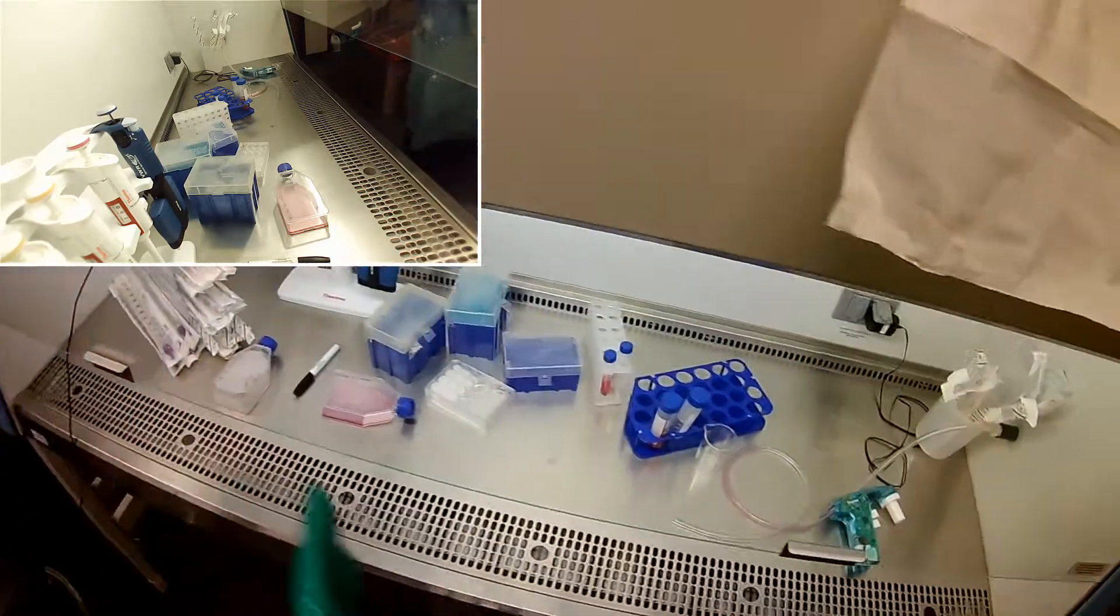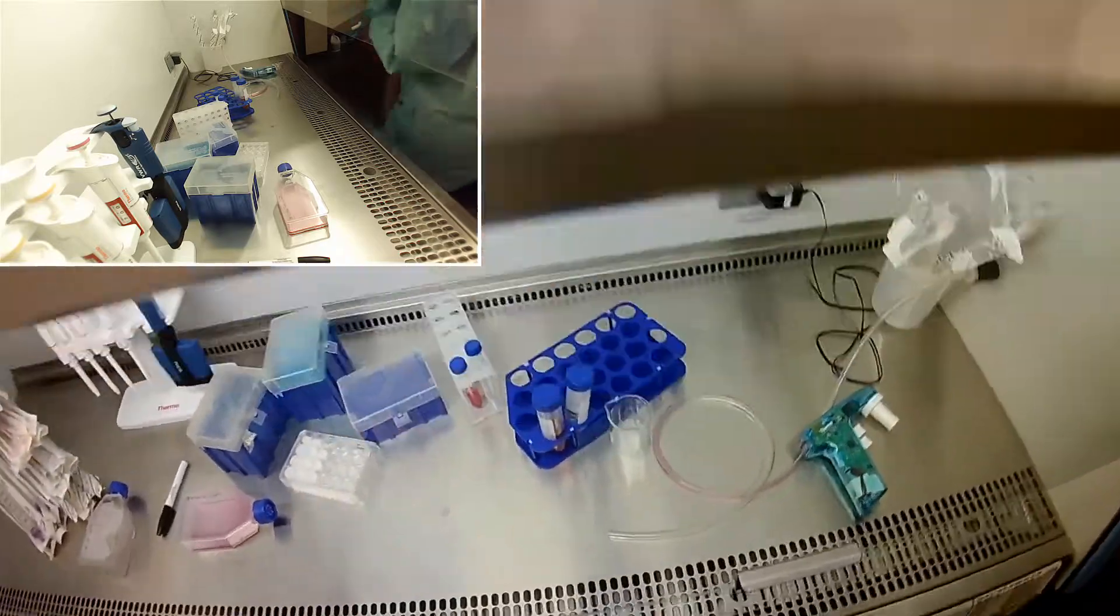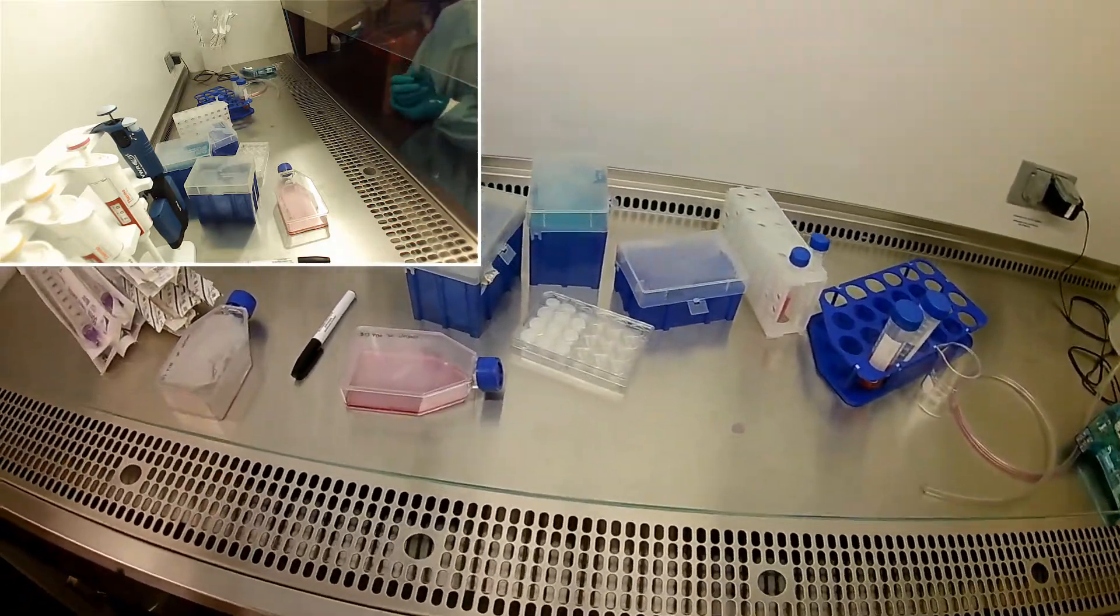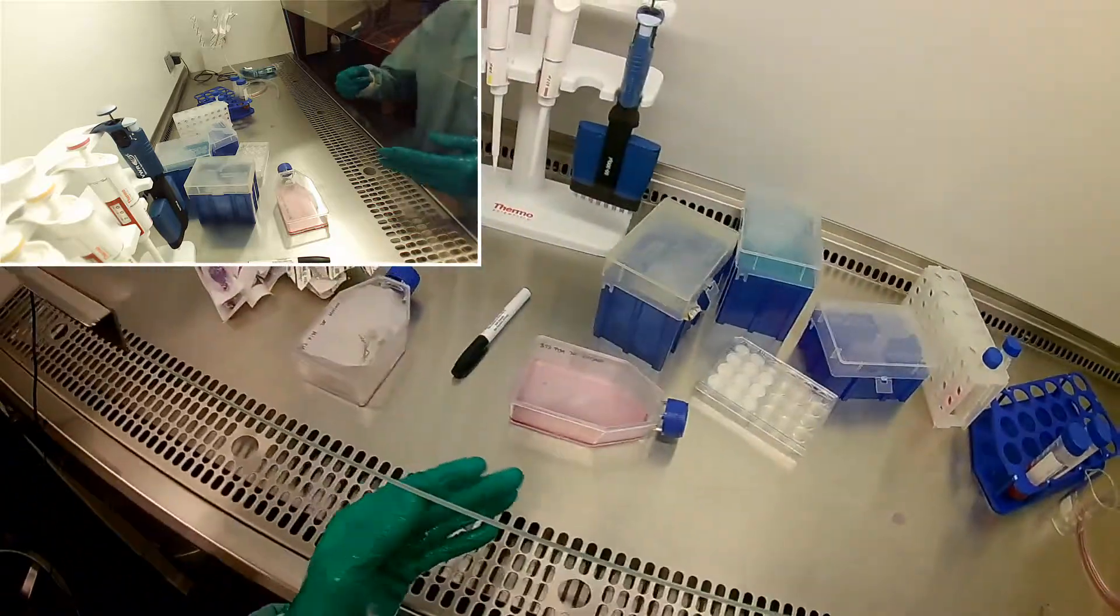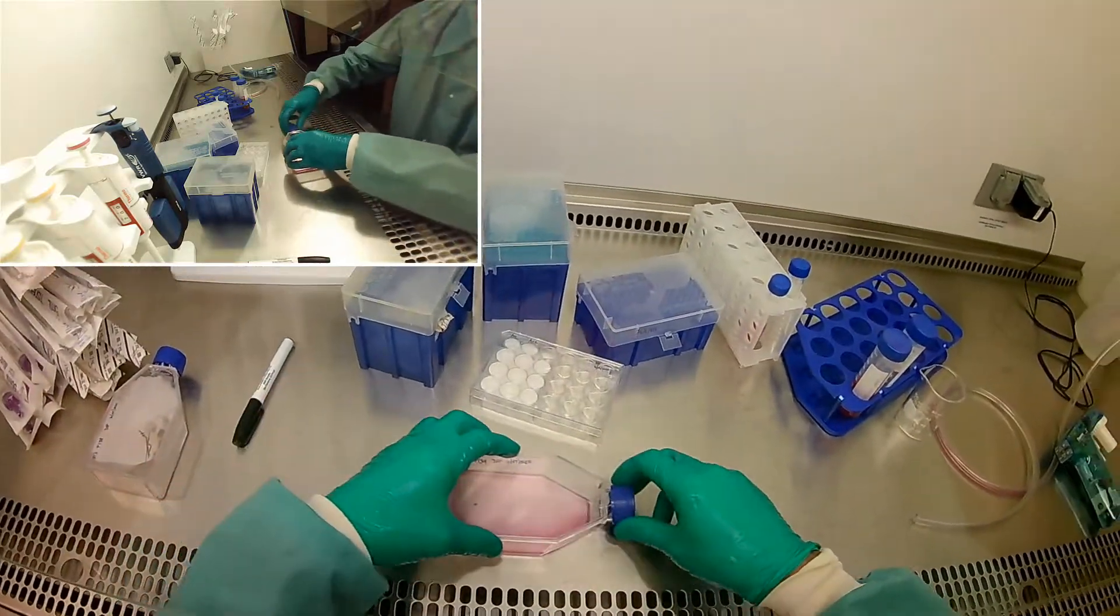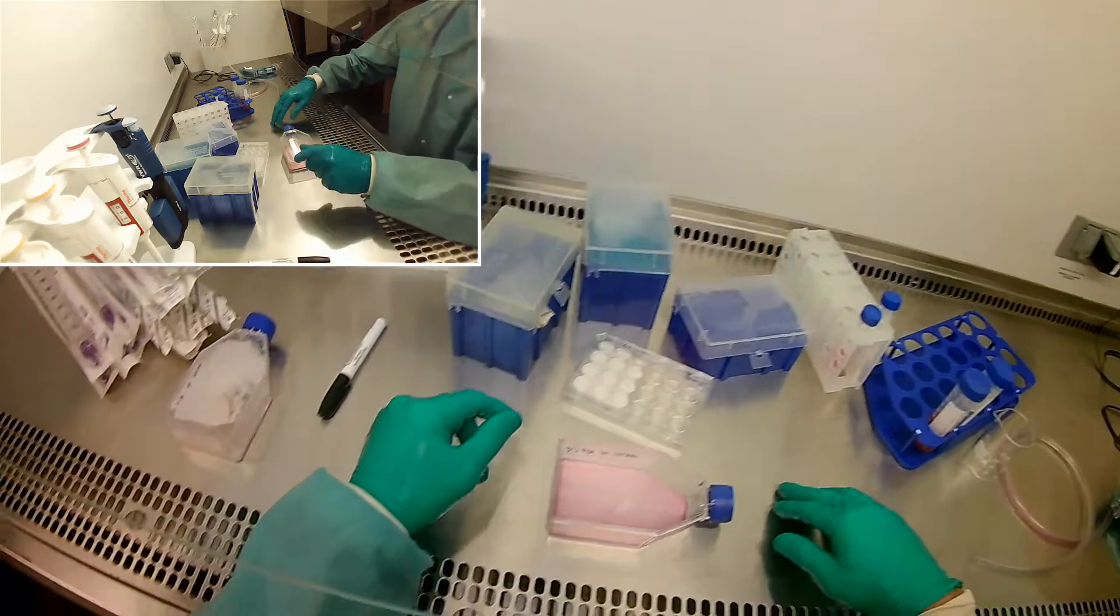We know how many cells we have. Interestingly, I counted a total of 870,000 cells in that flask. So my prediction of 800,000 to a million was pretty dang good.